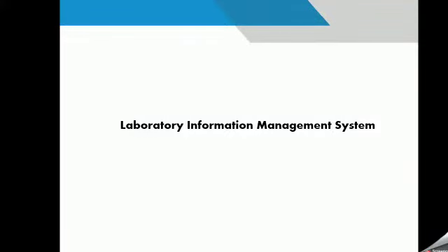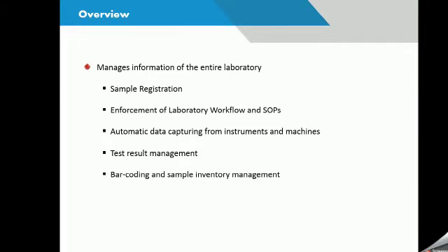Laboratory Information Management System, shortly called LIMS, is a software-based solution with features that allow management with complete information starting from sample registration to publication of results to customers, implementing workflow and SOPs, and automatic data capture using instrument integration, that is, fetching results directly from testing instruments and test results. It derives an integrated picture of every laboratory resource taking part in the specific analysis, such as manpower, equipment, and standard operating procedures.